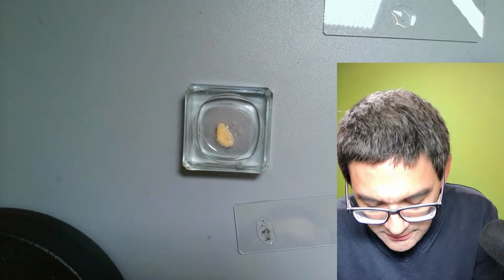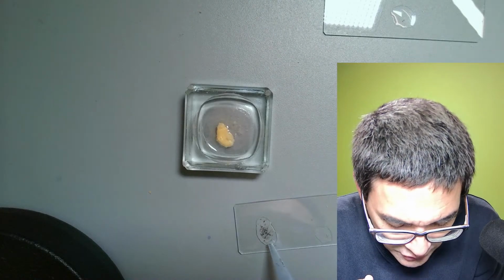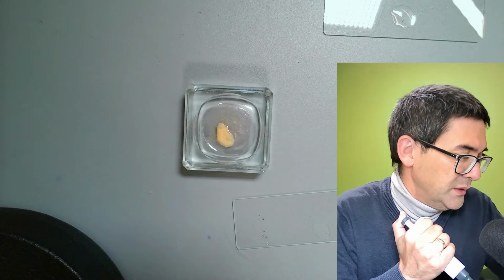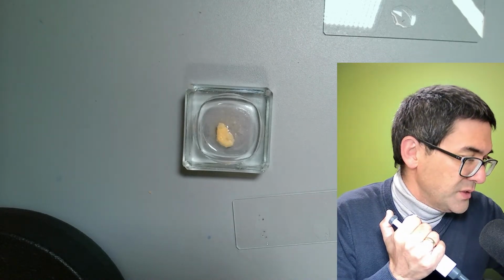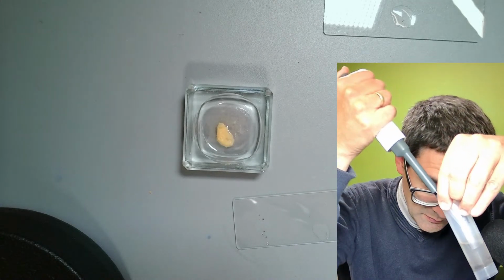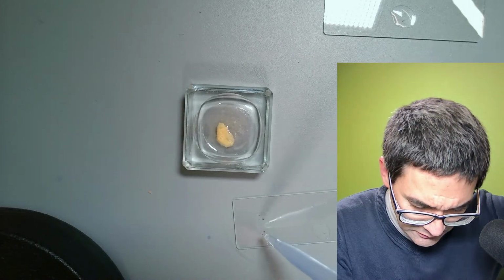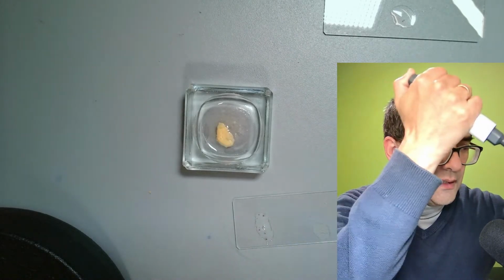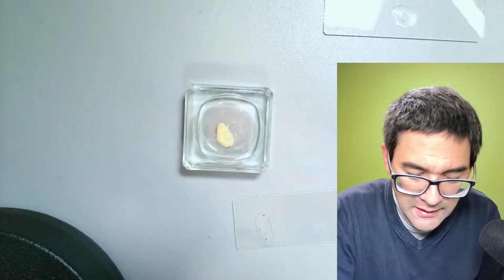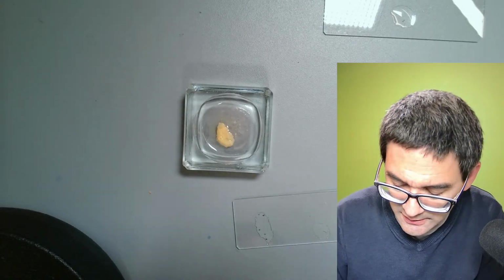So here we go. Let's remove all of the solid material and the larger particles here. So that's number one. Where was this? This was here. It's back again. A little bit more. Okay. Then a cover glass goes on top. And then I'm going to be adding some of this spice from the side of the cover glass, and let's see how this works.